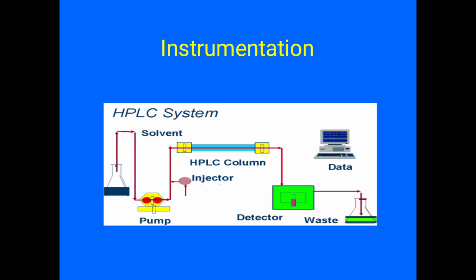Instrument. The basic requirement in an HPLC system: solvent, pump, HPLC column, injector, detector, waste, and data.